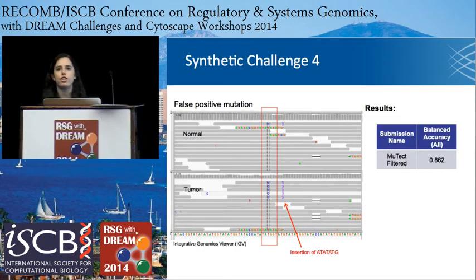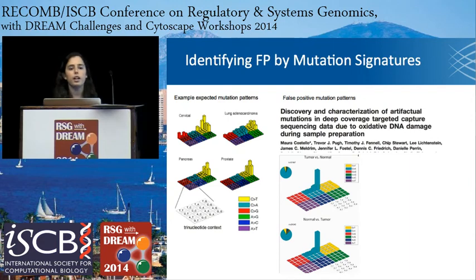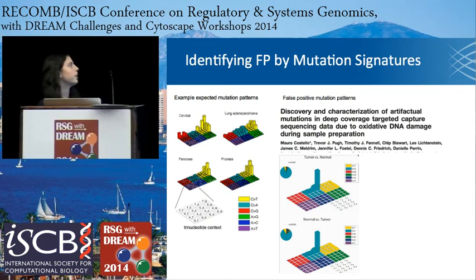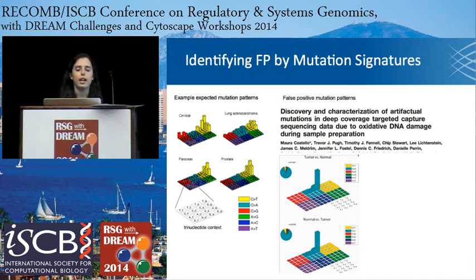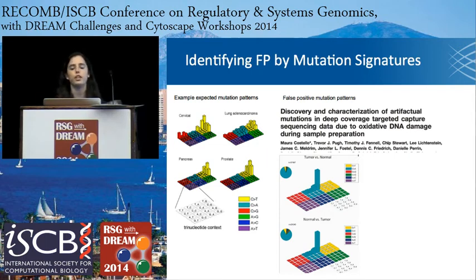Another way to identify false positives — which we utilized in this synthetic data and other datasets — is to look at mutational patterns. There are a number of recently published papers, including one from Mike Lawrence, that look at mutation signatures across various cancer types. In these Lego plots, each different tumor type has a unique signature: cervical cancer has an APOBEC signature seen in the back row, and lung adenocarcinoma has a smoking signature with many C-to-A mutations. Having an understanding of what mutation pattern you'd expect in your tumor type gives you some idea of whether you're seeing false positives or rare true mutations.